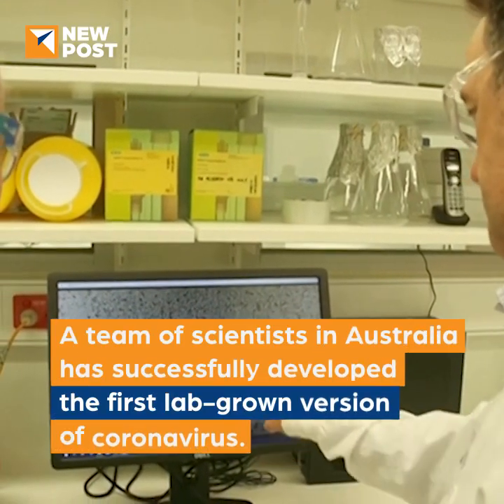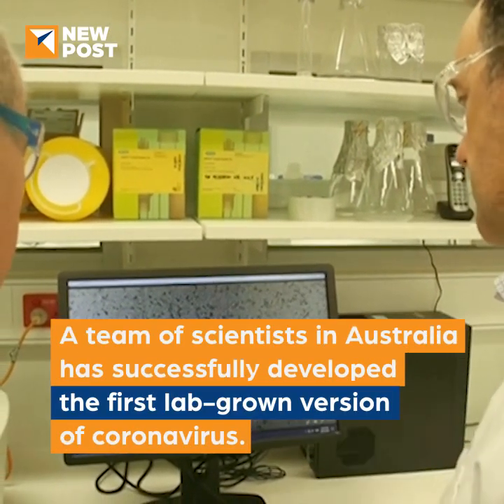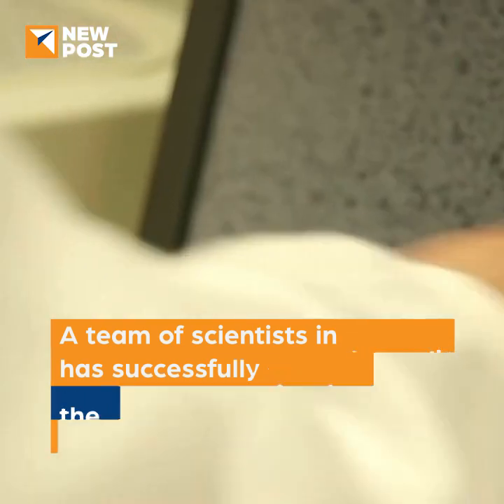Cells, and you can see the little dots around the cells. So this is a cell sheet, and this is a cell monolayer that's being infected with the virus.